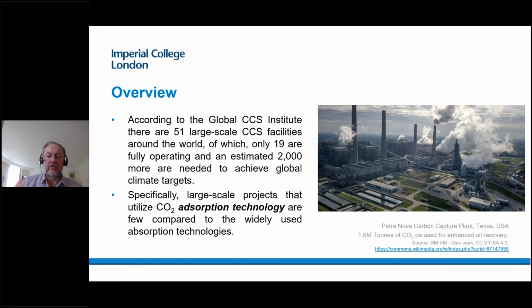And really the discussion I will make with you today is around what are the right sorts of experiments to conduct if you want to understand the CO2 capture behavior of materials, particularly under what I describe as real-world conditions.